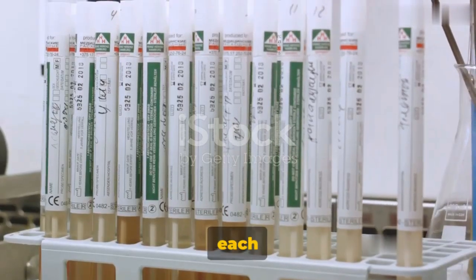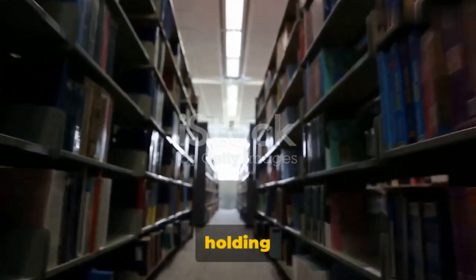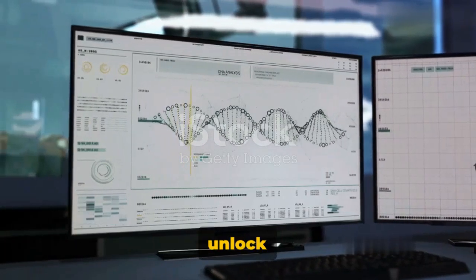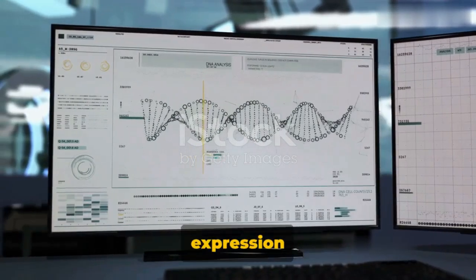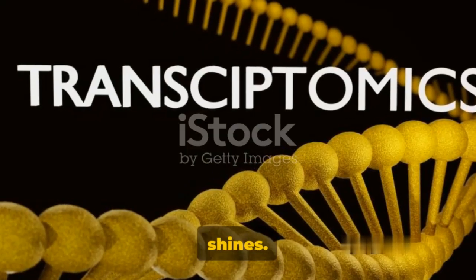Now imagine each RNA sample as a book in this library, each one holding its own unique story of gene expression. It's through sequencing these books that we unlock these stories. The data that emerges from this process is then analyzed to determine gene expression levels. And this is where RNA-seq truly shines.